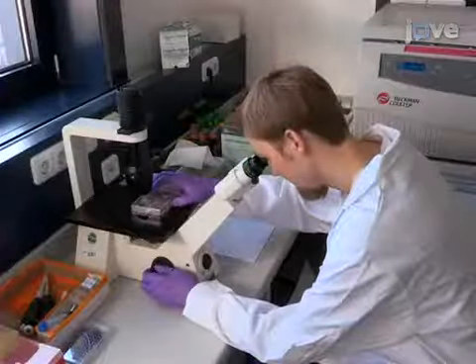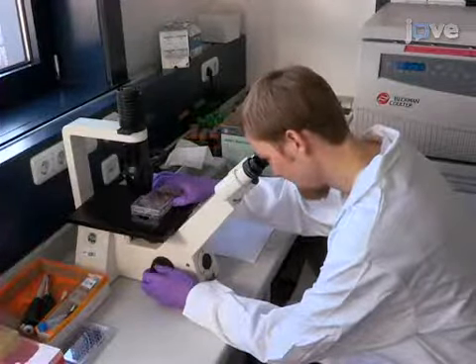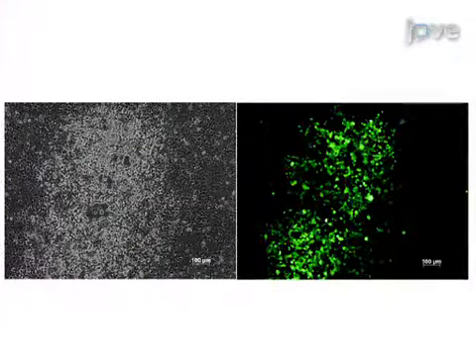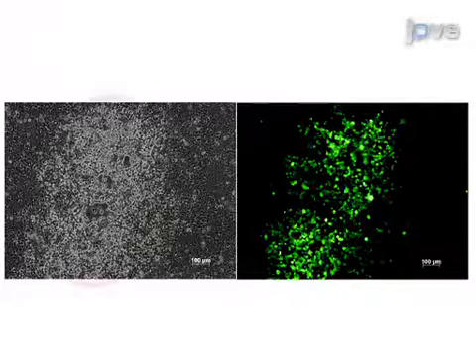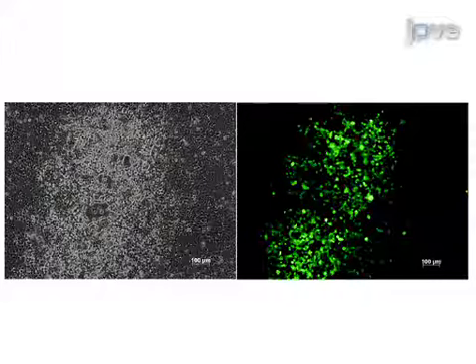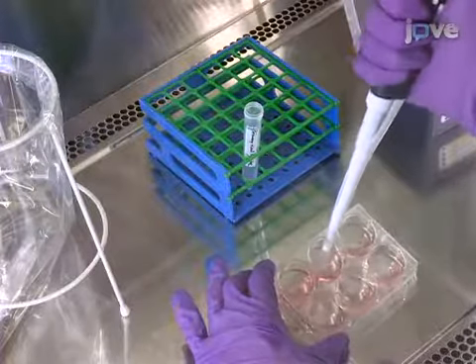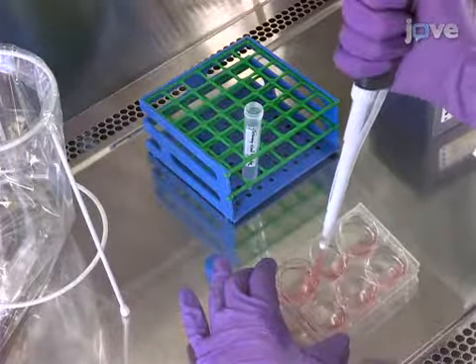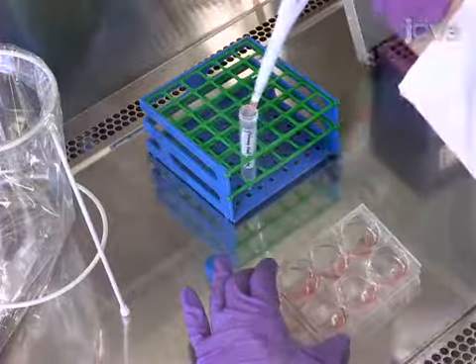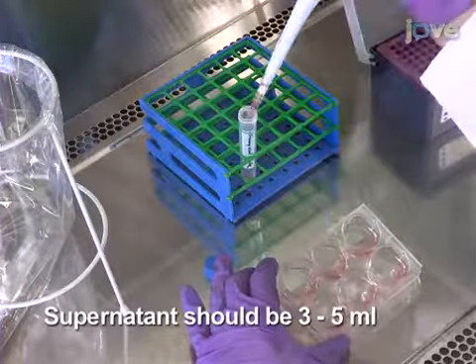Every 2 to 3 days, check for cytopathic effects, evidenced by areas with enlarged and rounded cells that start to detach. This is indicative of efficient virus generation. Once broader zones of cytopathic effects appear, all cells will be infected within 24 to 72 hours. When all of the cells show signs of cytopathic effects, but before an overall detachment of cells occurs, harvest the cells by gentle pipetting and transfer them with the supernatant to a 15 milliliter polystyrene tube.